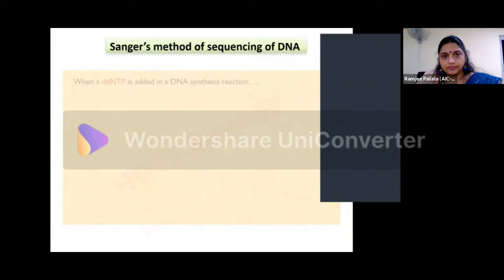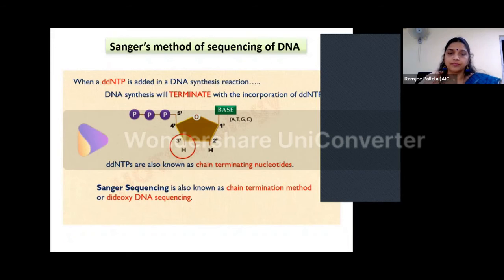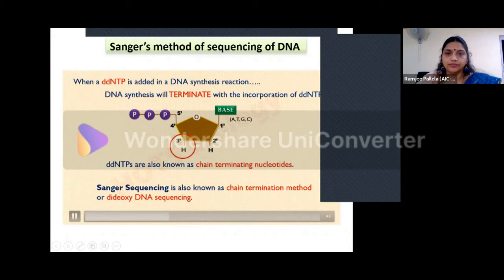If in a DNA synthesis reaction a dideoxynucleotide is added, the DNA synthesis will terminate with the incorporation of this dideoxynucleotide. This is because now there is no 3' hydroxyl group for the further extension of the DNA chain. For this reason, dideoxynucleotides are called chain termination nucleotides. And the Sanger technique is also known as the chain termination method or dideoxy DNA sequencing. So, if the concept of dideoxynucleotide is clear to you, it will be easy to understand the procedure and interpret the results of the Sanger sequencing technique.